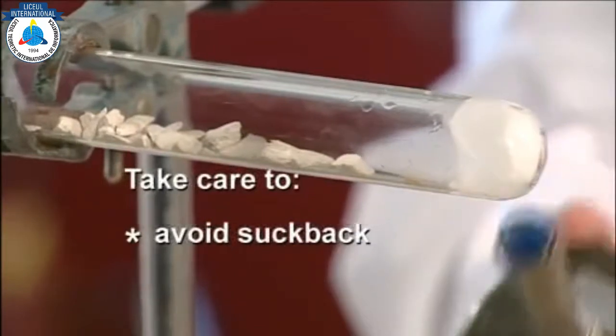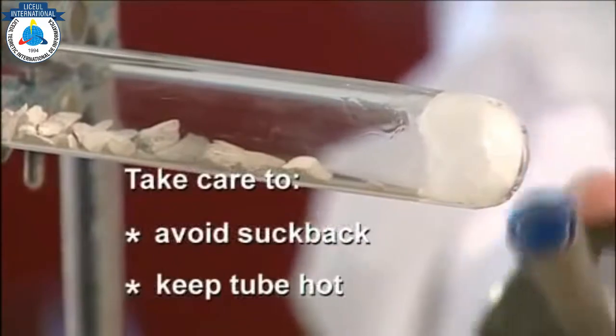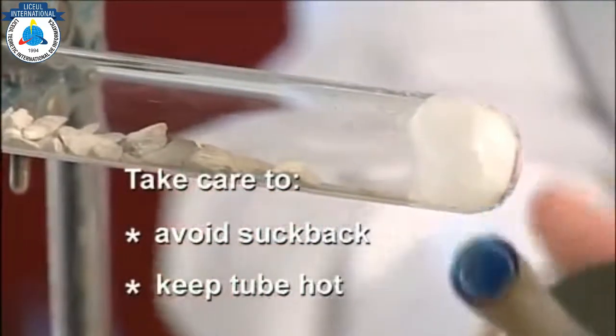Watch for signs of suck back. If this seems to be starting, it is tempting to push the Bunsen closer to the boiling tube or to remove the heat — both of which should be avoided.